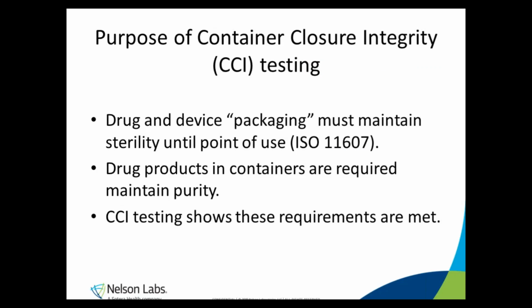Mass extraction is a CCIT or CCI test. It's a container closure integrity test. These are tests that are designed for rigid containers, such as vials and syringes and bottles. CCI tests are often used in place of traditional sterility type tests to show that the containers are sterile and will remain sterile throughout the expected shelf life.